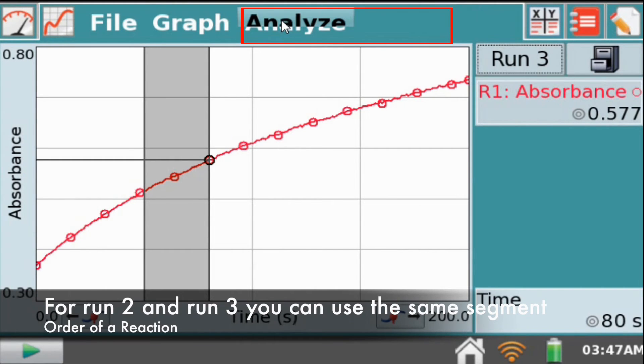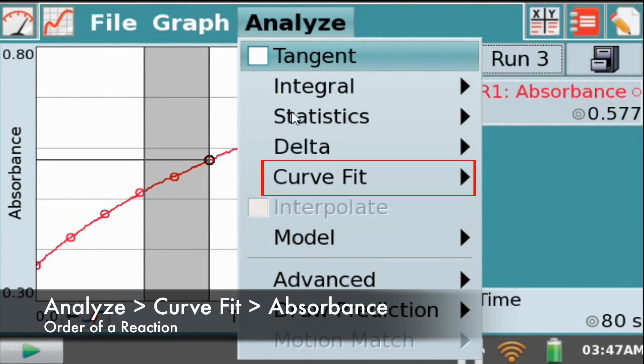Now select analyze, followed by curve fit and absorbance.